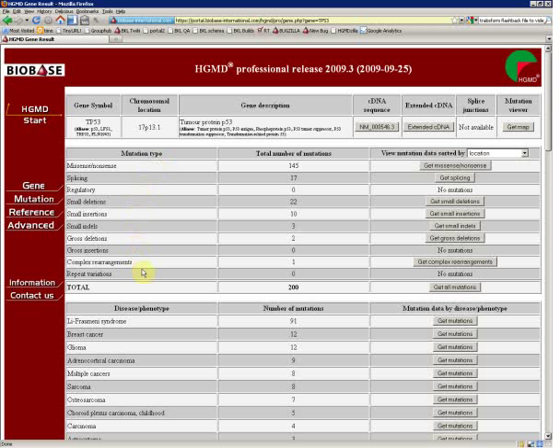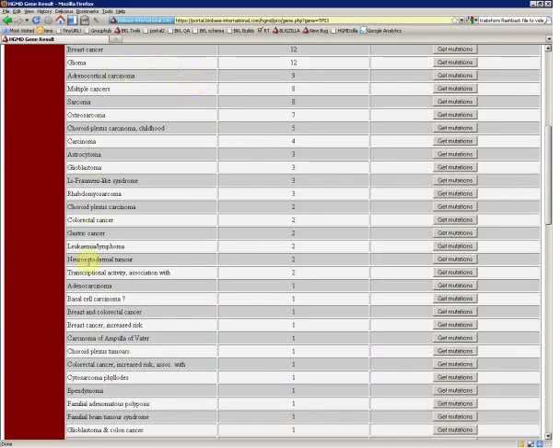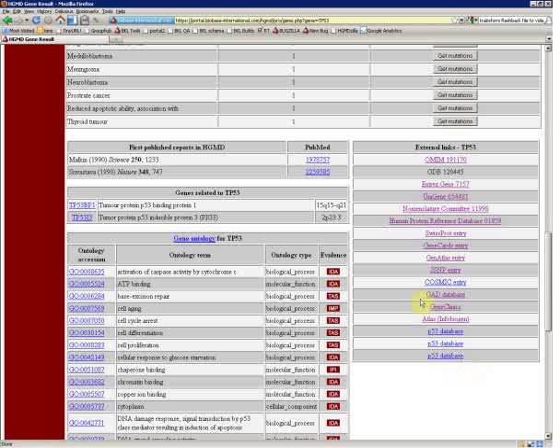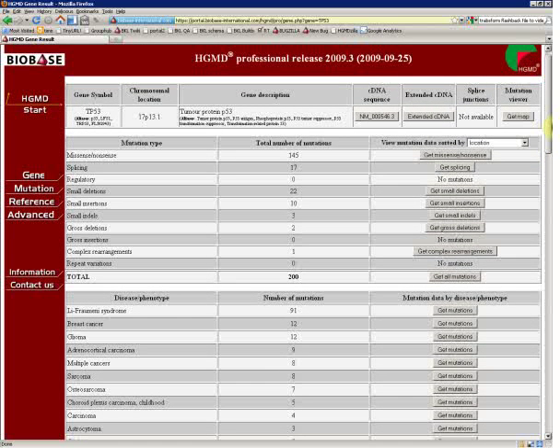The mutations are broken down by type, but there is much more detailed information available on those mutations in the database. For example, you can see all the different kinds of diseases that are associated with those mutations. You can also see external links to many different other databases which give you more in-depth information on these genes, and find functional annotations about them. You can also find the first published references on these mutations.